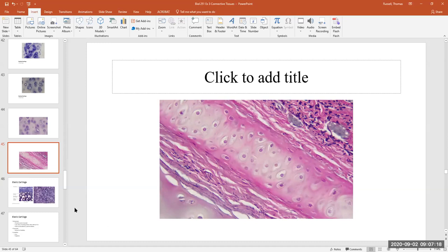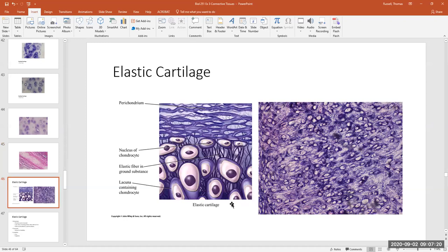Looking at this cartilage — elastic cartilage — all cartilages have lacunae where the chondrocytes live. In elastic cartilage there is an abundance of elastic protein fibers. Elastic cartilaginous pads also contain a perichondrium. Here's a real photomicrograph of elastic cartilage. The little holes are the lacunae, and now on the outside of the holes you see little dark-staining protein fibers — those are the elastic protein fibers.